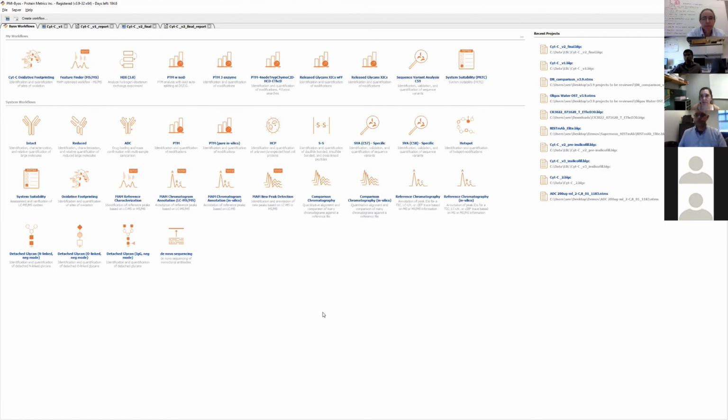Okay, so how do we do it from scratch, or how do you do it from the workflow that we sent for this particular data set? I think, Ilker, if we can do it, because we sent the FTP with the files, the workflow and the FASTA, if we could do it by loading the files and then opening the workflow, they could replicate that.